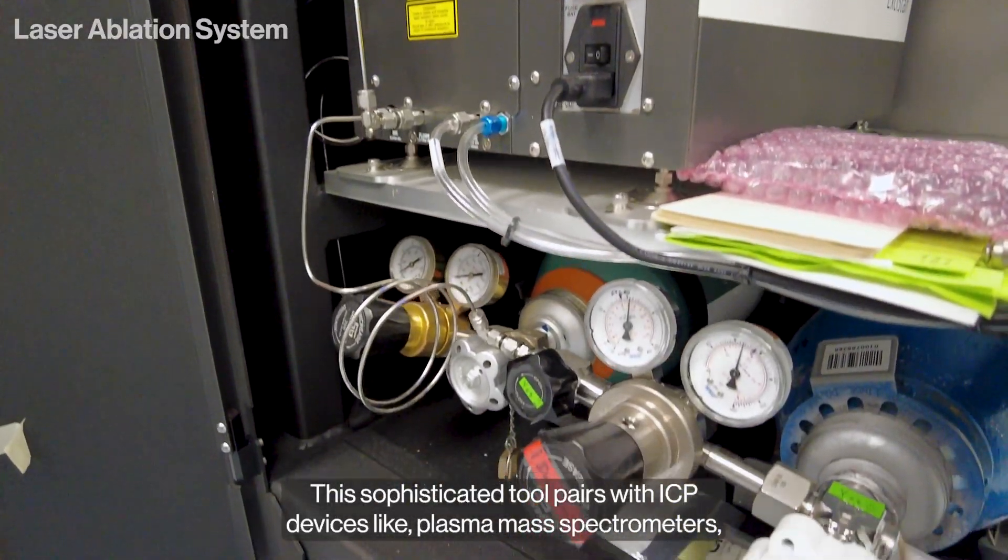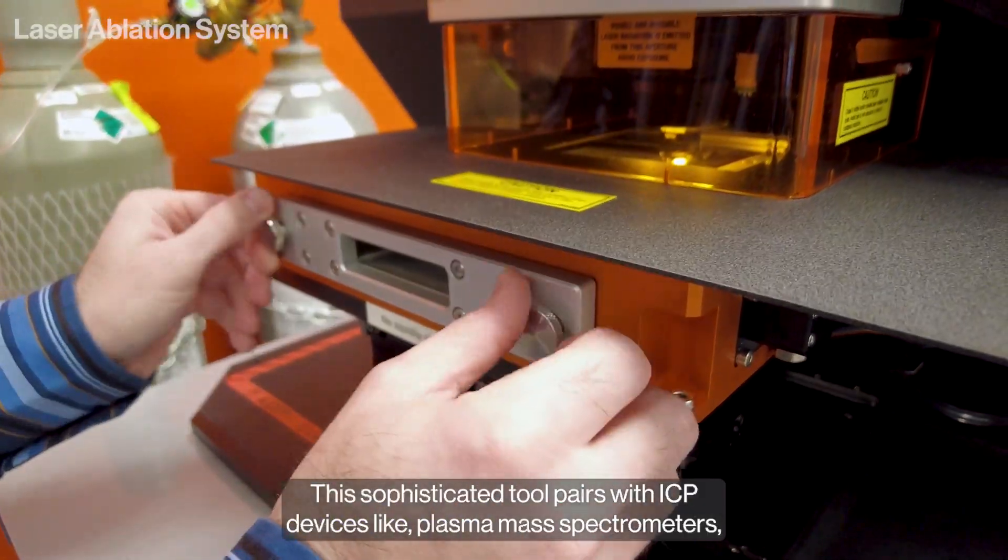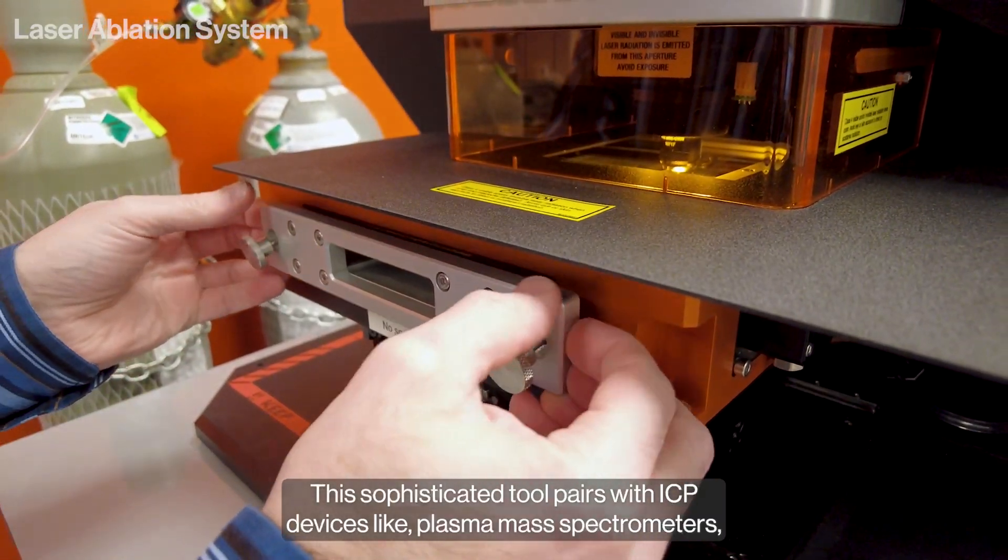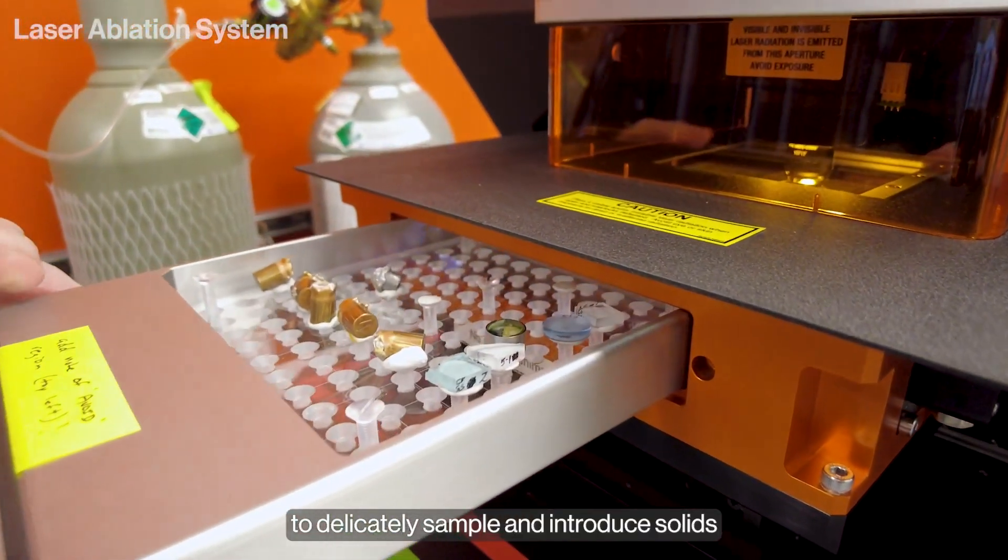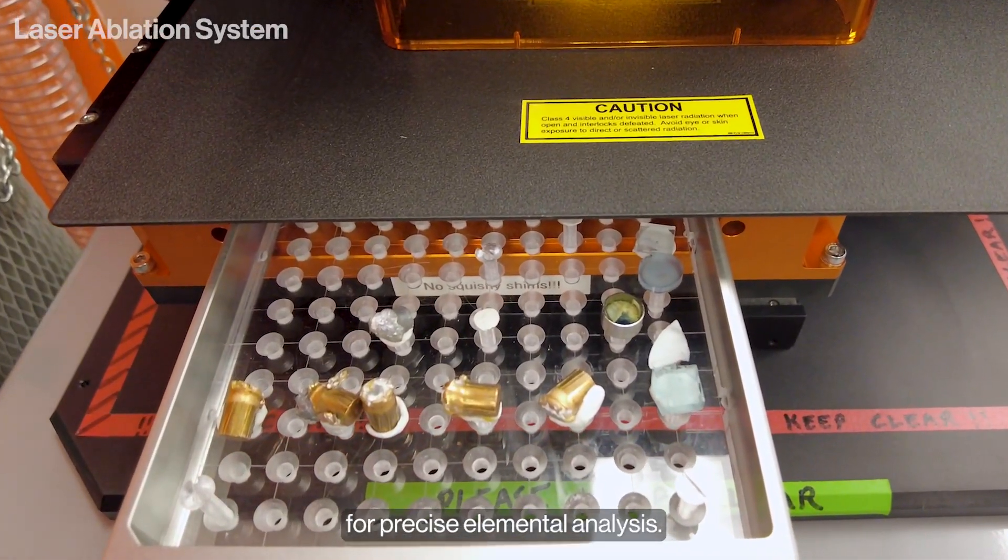This sophisticated tool pairs with ICP devices, like plasma mass spectrometers, to delicately sample and introduce solids for precise elemental analysis.